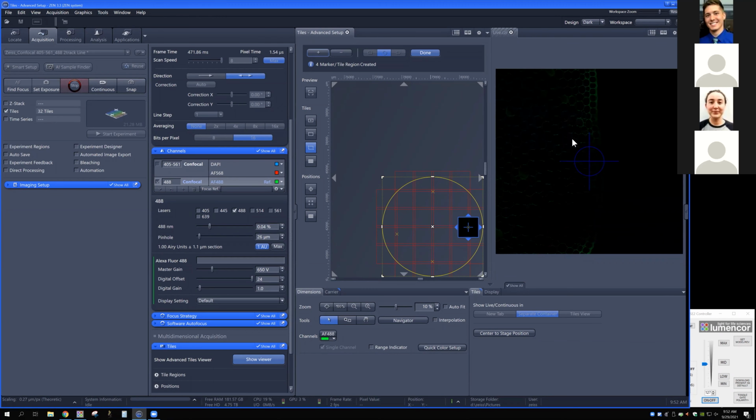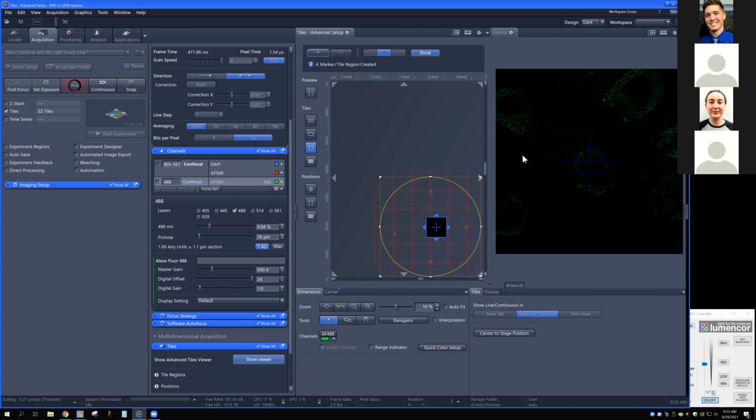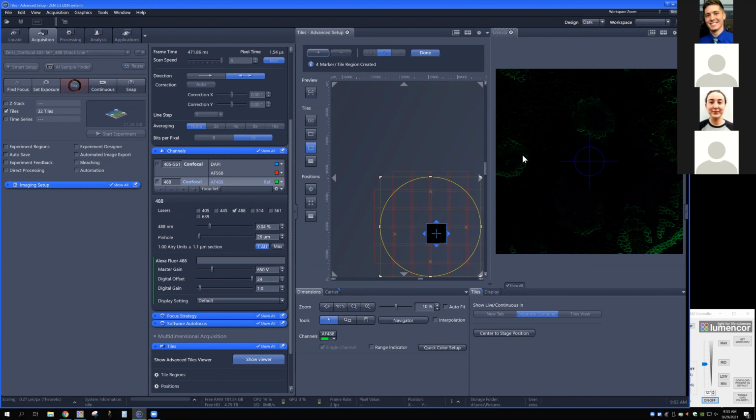And I'm going to leave you a couple of buttons here that would allow you to actually do this through the eyepieces, so that if you prefer to do this with your eyes on the eyepiece and one hand on the mouse, you can do it very quickly with the joystick as well. Because I'm clicking around through the software just because everyone's on Zoom, but don't forget that I could be moving the joystick here instead. And that can be a very fast way to navigate for everyone who's more familiar with doing things that way.